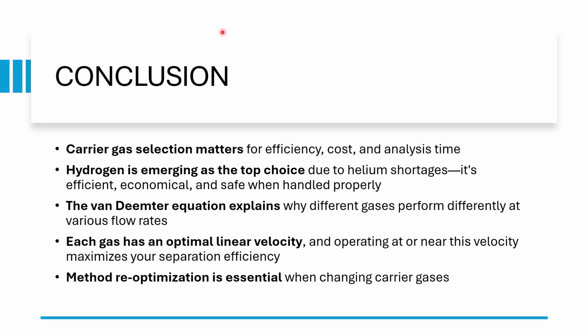So let's wrap this up with some key takeaways. First is carrier gas selection matters for efficiency, cost, and analysis time. Second is hydrogen is emerging as a top choice due to helium shortages. It's efficient, economical, and safe when handled properly.